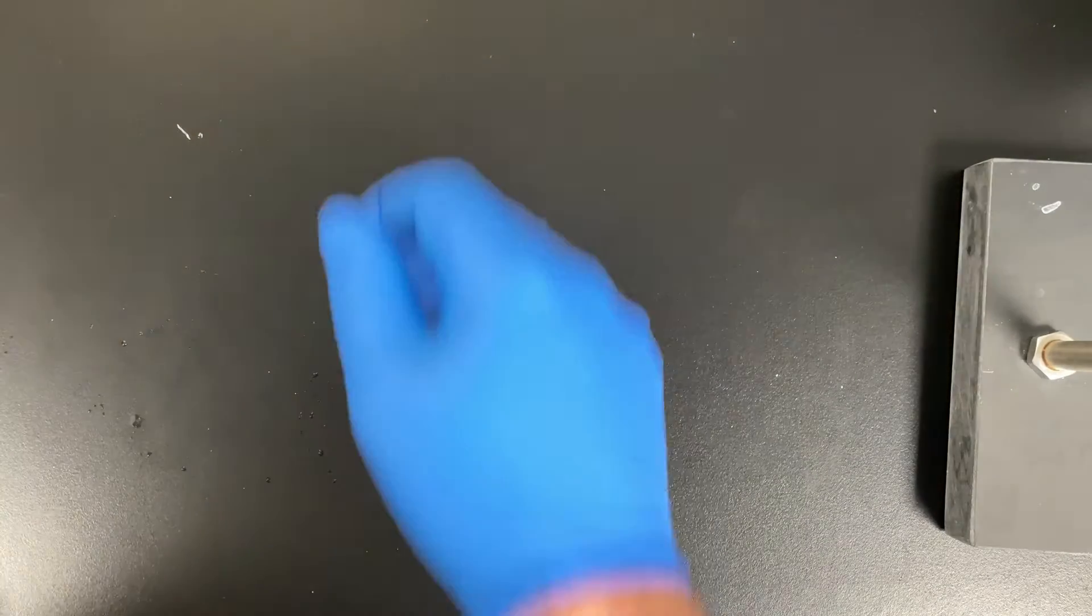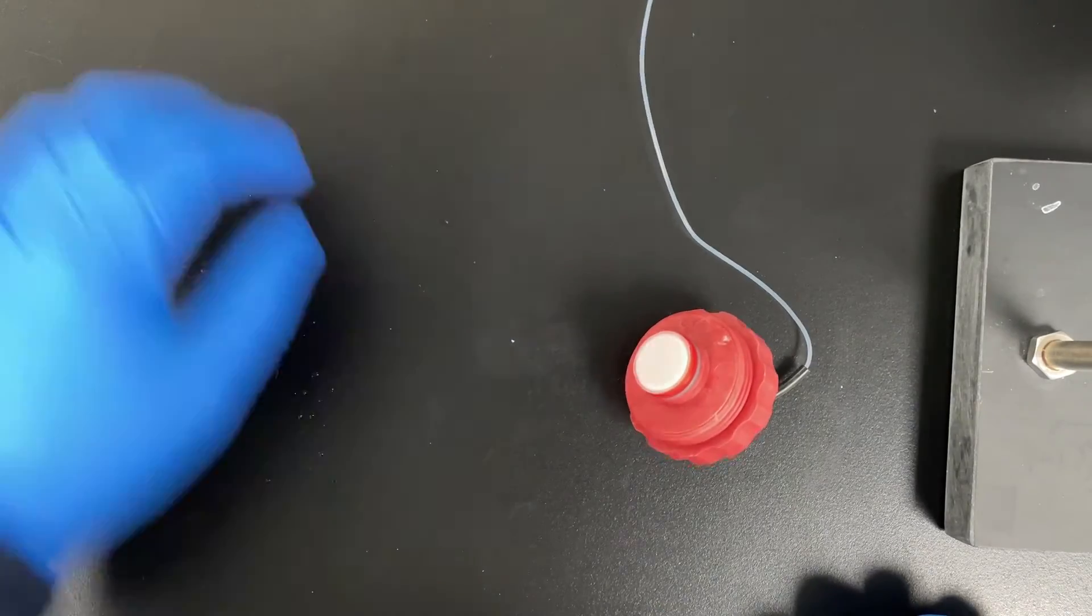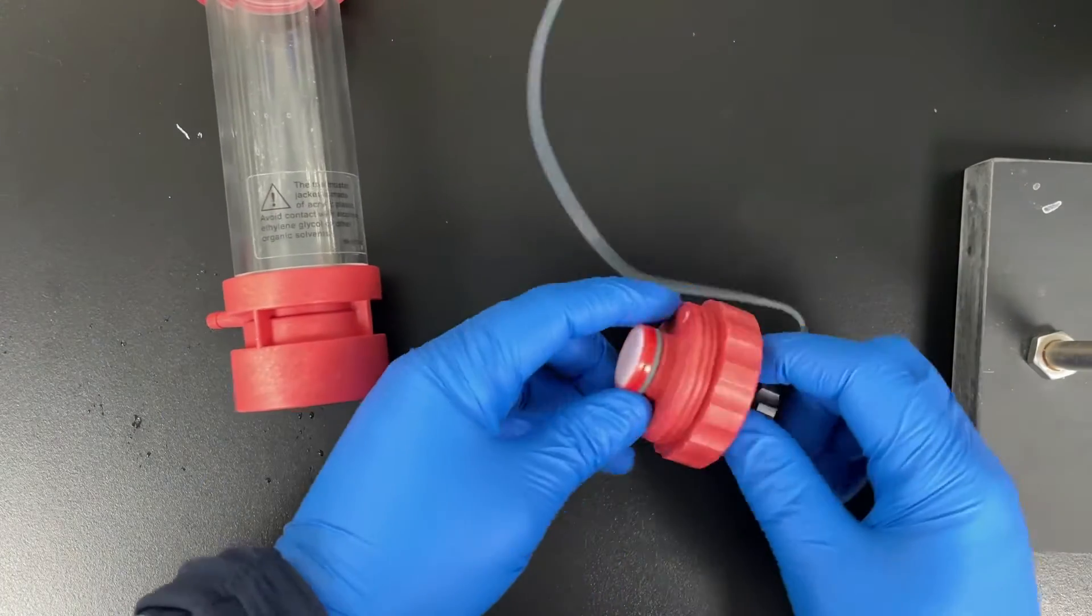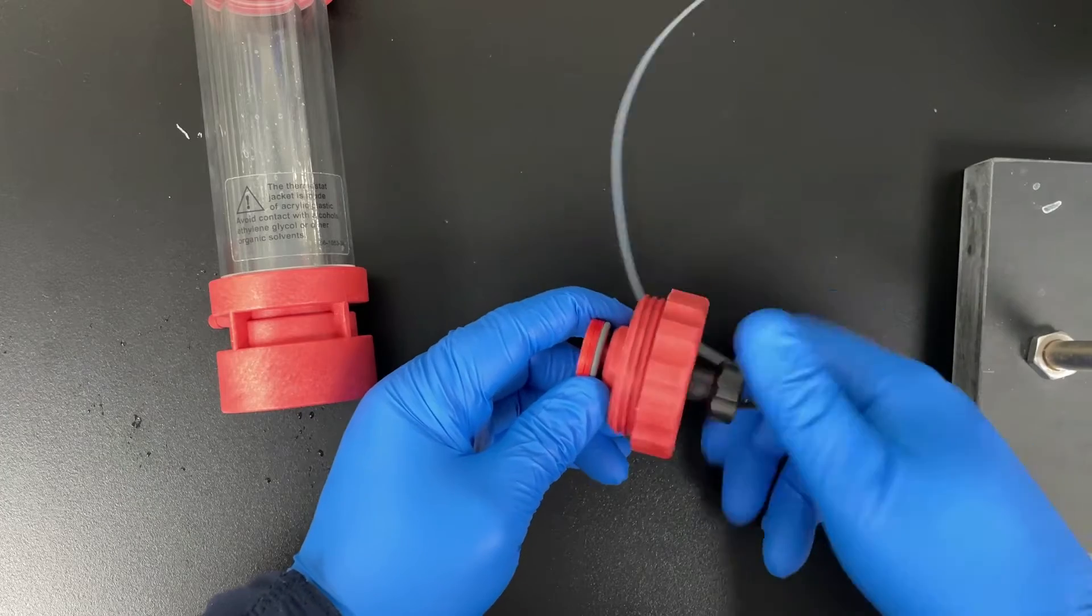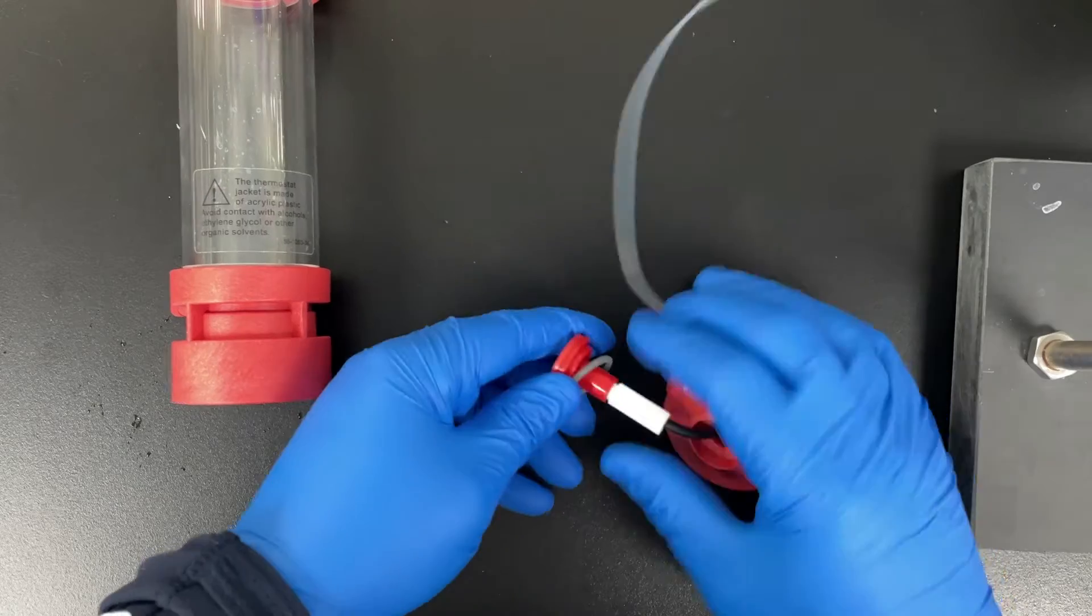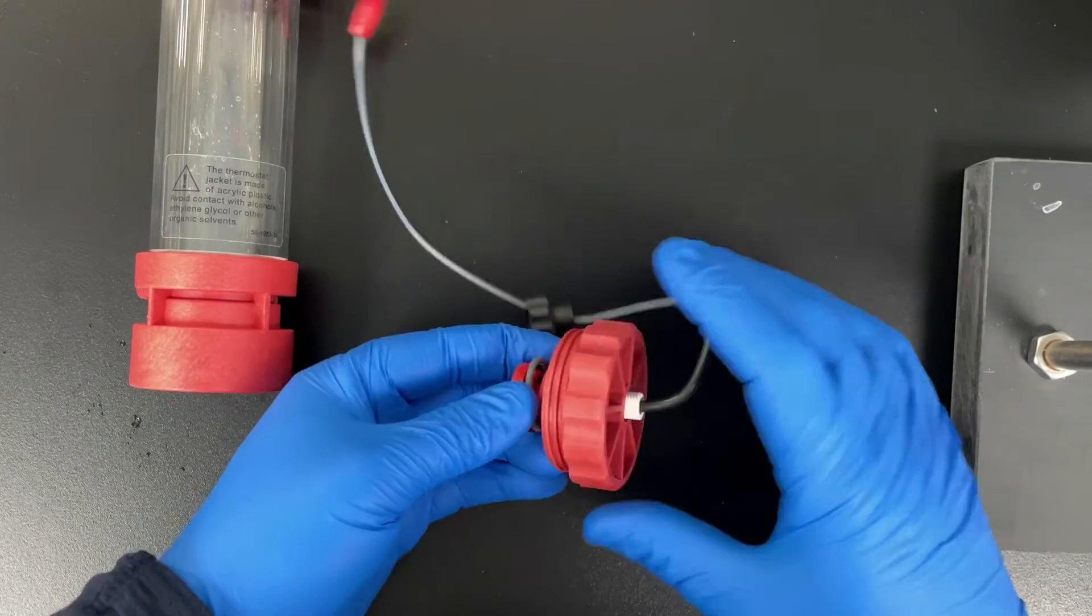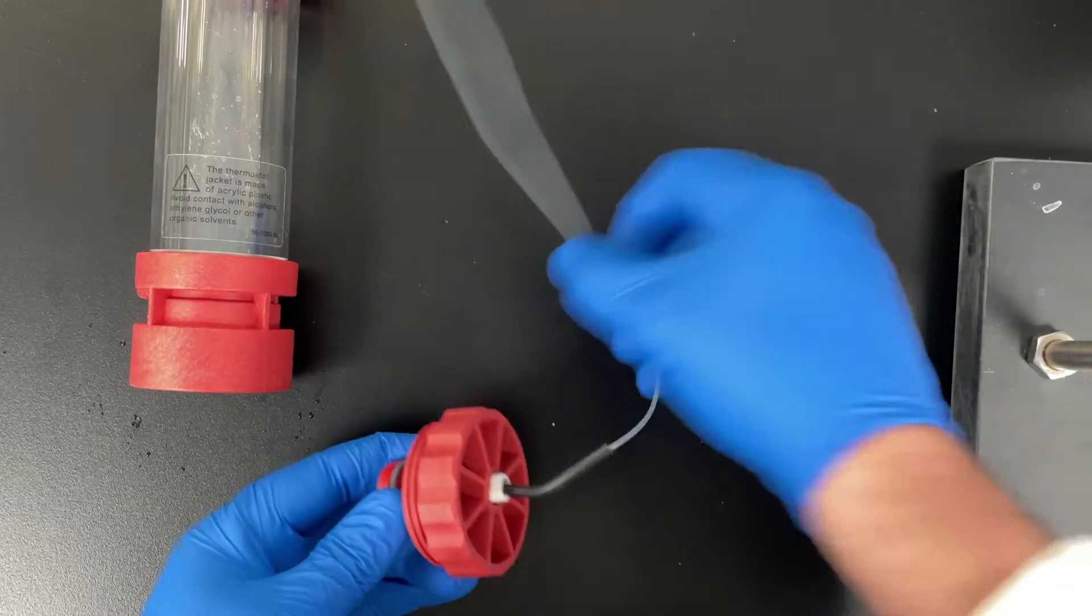The next thing we're going to do is check the bottom adapter for pretty much the same thing. We want to make sure that we're using the right screen, there's no damage to it, and that the distributor and central stem have a nice snug connection. Looks good. And then we'll just put it back together.